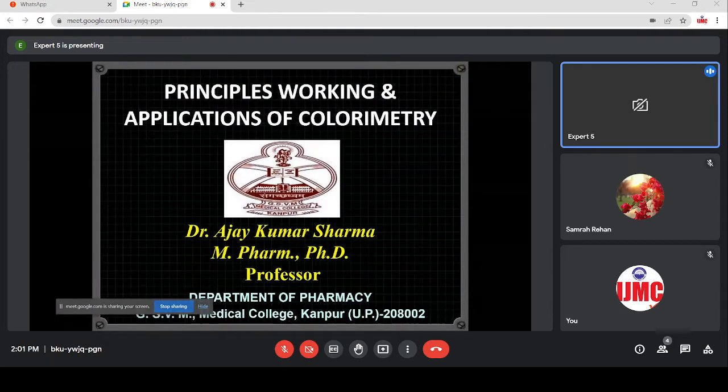Before starting, I want to introduce the subject. Basically, the topic given to me for this talk is the principles, working and application of colorimetry, spectrophotometry, ultracentrifugation, ultrafluorescence, X-ray diffraction. Basically, these are the tools or techniques which are essential mainly for biomedical, biochemistry and pharmaceutical sciences.